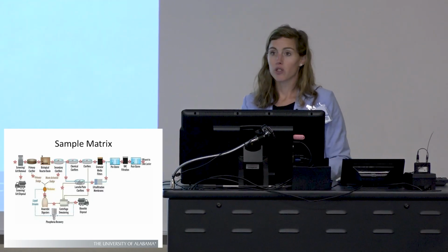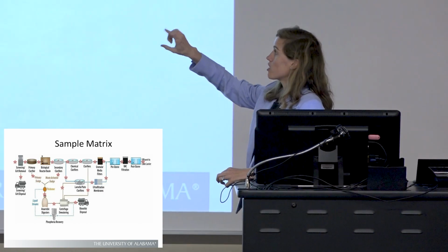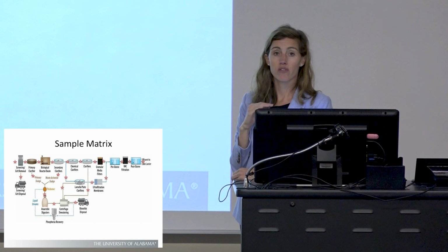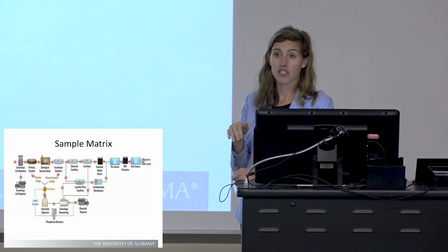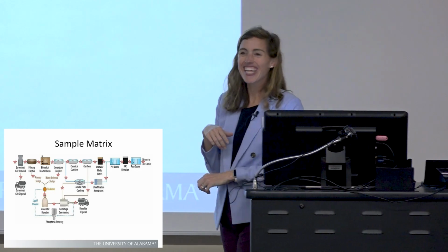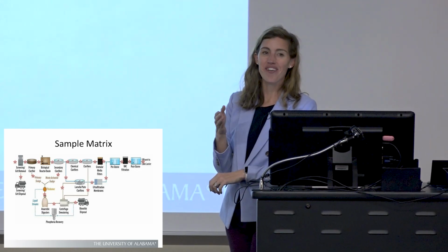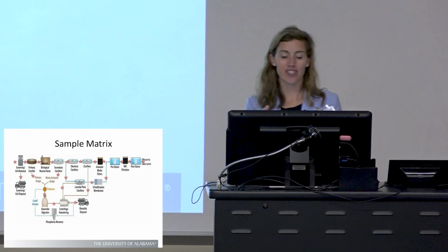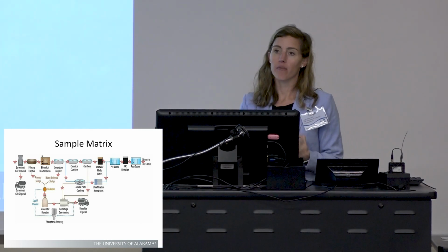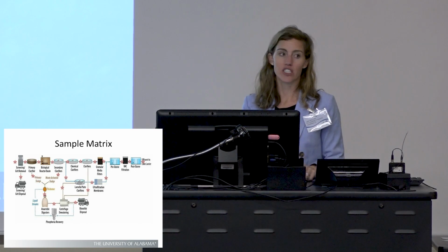So this is the wastewater treatment plant that we'll be sampling, and so we'll try to sample coming in and then after each unit process, the liquid train as well as the solid train. So I was like, can we sample at all these locations? They said yes, so we're going next week. So hopefully we'll be able to sample at all these locations and then measure the organic fluorine and the 17 PFAS at each of these locations.